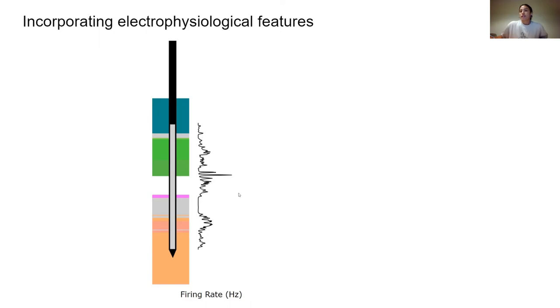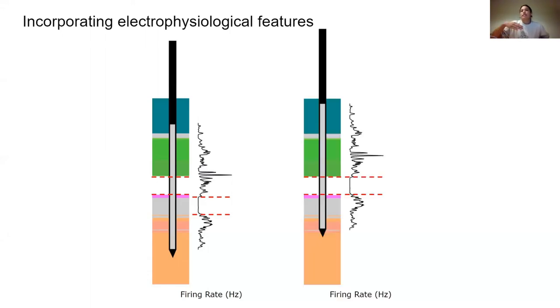But in the current alignment that's been done, we can see that there is some activity here. So what we want to do is basically apply reference lines, both on the histology image and also on the electrophysiology, and shift the location of the electrodes to positions where we think they should match. So in this example here, we've shifted the electrodes up in the brain, and we can now see this quiet area in the firing rate matches this air gap.